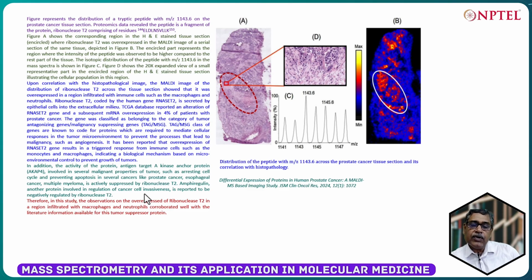So, it correlates very well with its expression that we are seeing through the MALDI image and the literature information talking about its functional property.